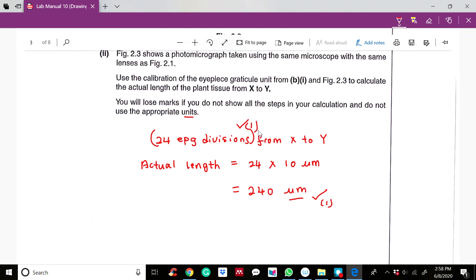Note that due to different perceptions when counting, you may get slightly different results. For example, you might count 24 or 27 eyepiece graticule divisions from x to y. Any value between 23 and 27 divisions will be acceptable.